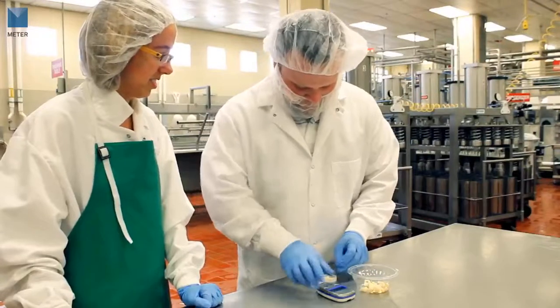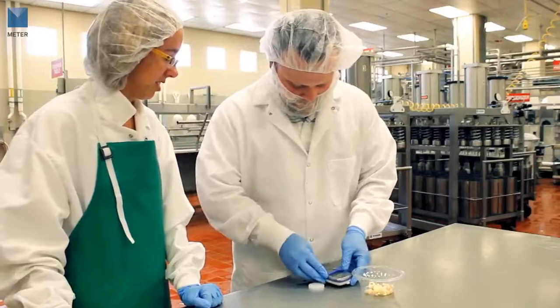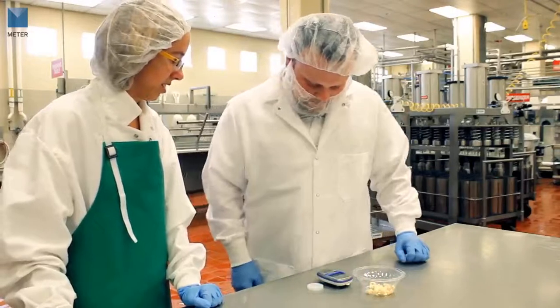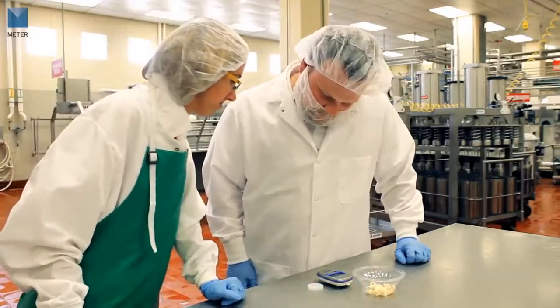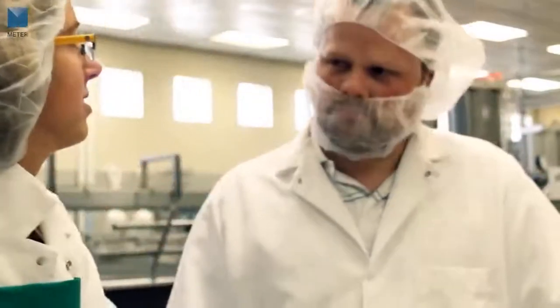the pocket sure comes in handy. You can take a quick, discrete measurement anywhere in the plant with ±0.02 accuracy and resistance to volatile interference. The pocket is just accurate enough to detect whether or not something is seriously wrong in the production process.